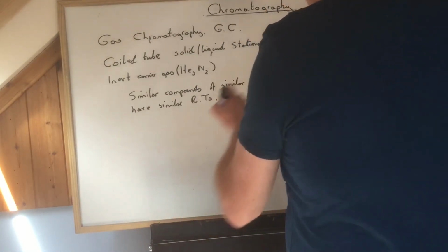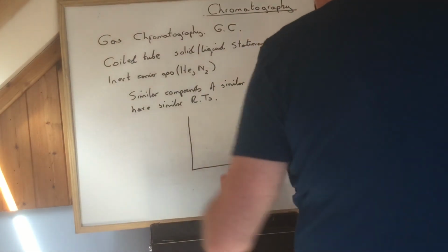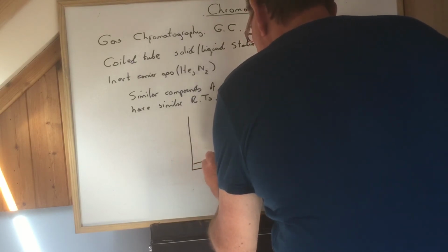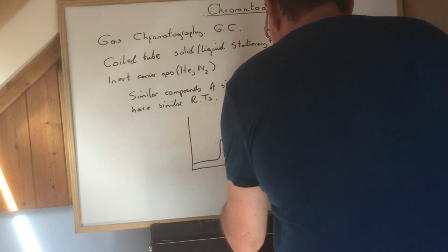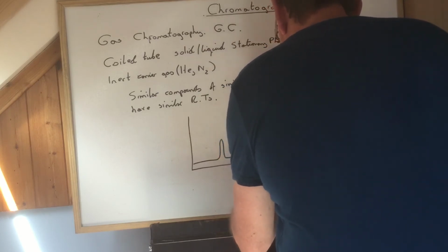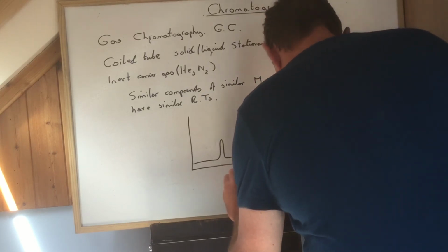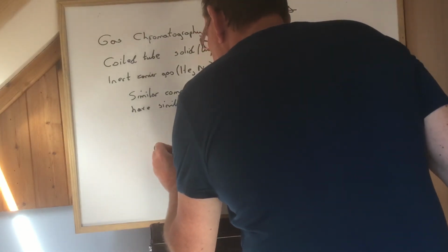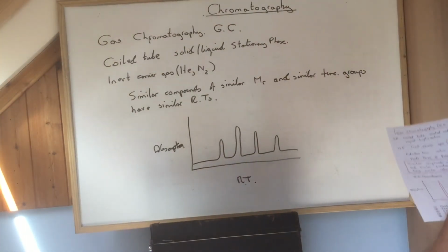So you wait, and then in your little mixture, oh, this has come out, oh, this has come out. It's separating them out. So there's your RT, your retention time, and I think this is absorption here. So what could these be?